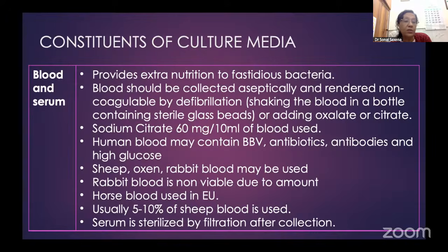Horse blood is used in EU because they have those stud farms from where they get this blood. In India, it's a problem because horses are not bred for recreation or anything. They're hardly used, so it's not usually preferred. So the purpose is to give nutrition, and you can use any type of blood.